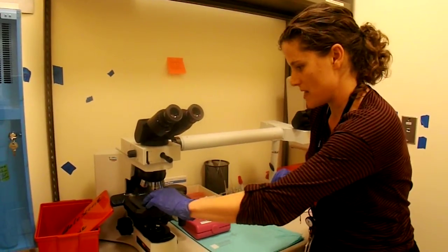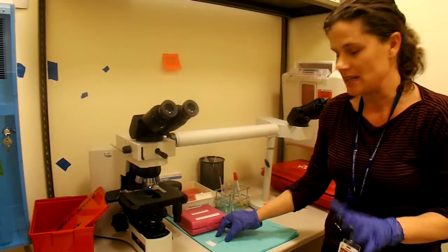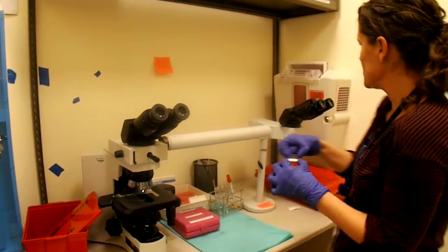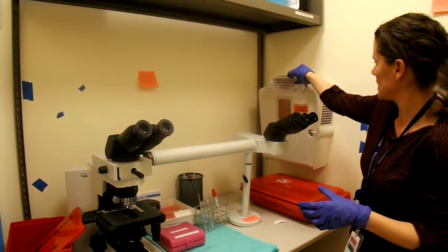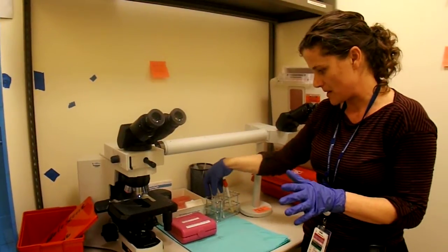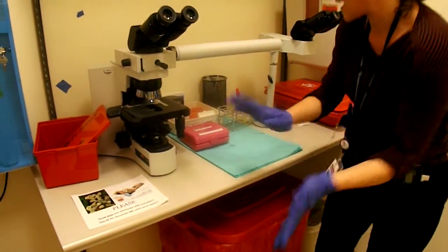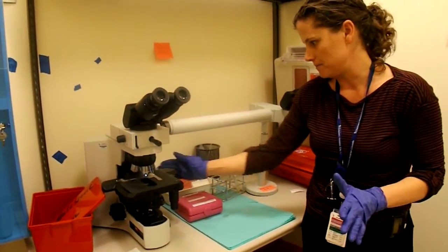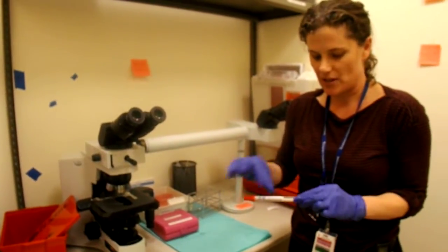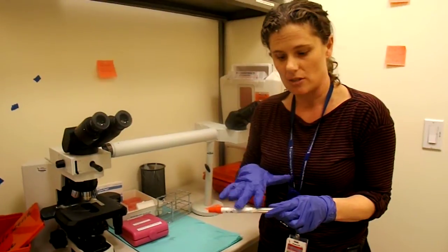When you're done with everything, and you can always have an attending look, you need to make sure you clean this area up. That's really important. The glass slides go in the sharps container, which is on the wall. You'll throw those away. All your samples, unless they're being sent to the lab, should be thrown away in the biohazard bin. Everything else should be left in here. If you have a sample that you need to send, you have to make sure the sticker's on it. You have to make sure your initials, the date and time are on the stickers.